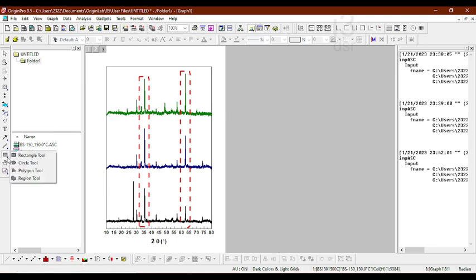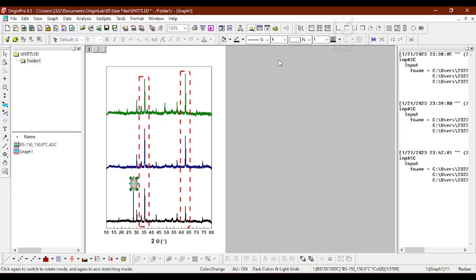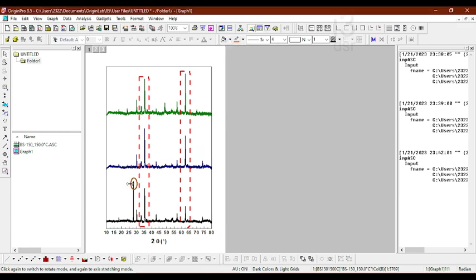I'm going to click on this blue dot, take a circle, and put a round. So we would say that this has disappeared. Similarly, I'm going to make it out of 4. The color, let's say pink or orange. And then I do not want anything to be filled inside so that it is transparent. So now I have highlighted this.